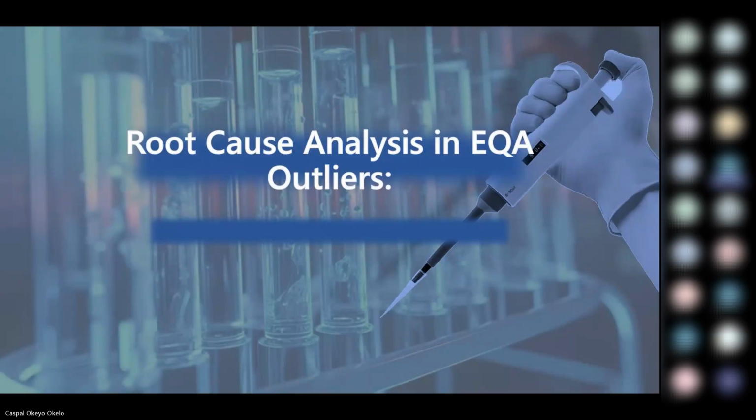We want to define a structured root cause analysis method, and then be able to distinguish between random and systemic causes of EQA outliers. We'll also be able to develop effective corrective and preventive action plans, and understand how to document investigations for audit and accreditation purposes.